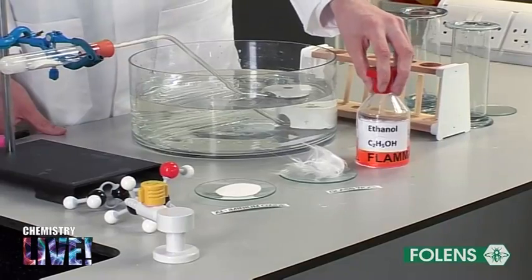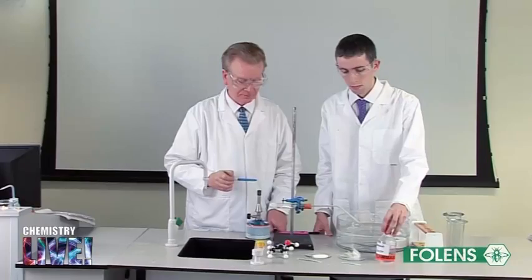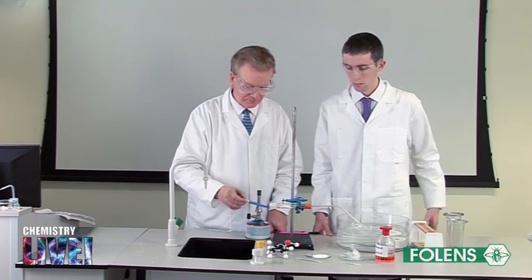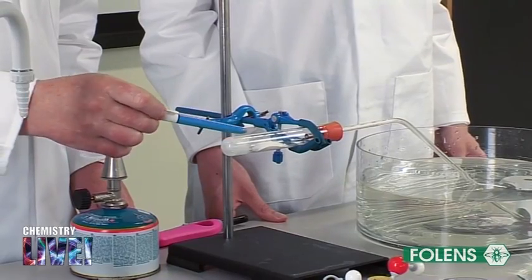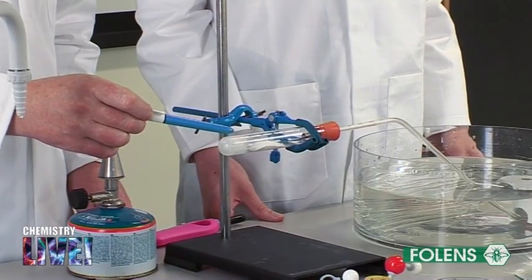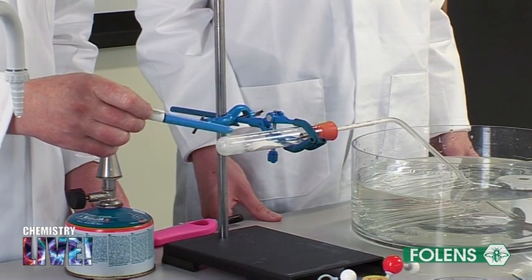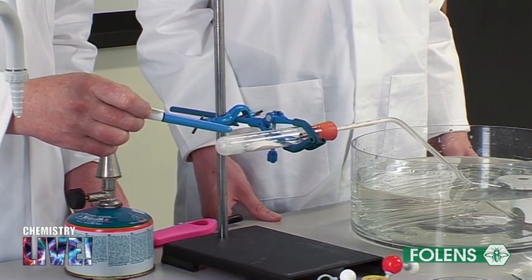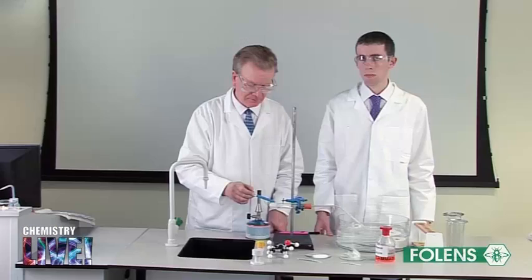Some ethanol was poured into a boiling tube to a depth of about 2-3 cm. Some glass wool was added to soak up the ethanol. The glass wool is used to hold the ethanol in place while the reaction to produce ethene is occurring.